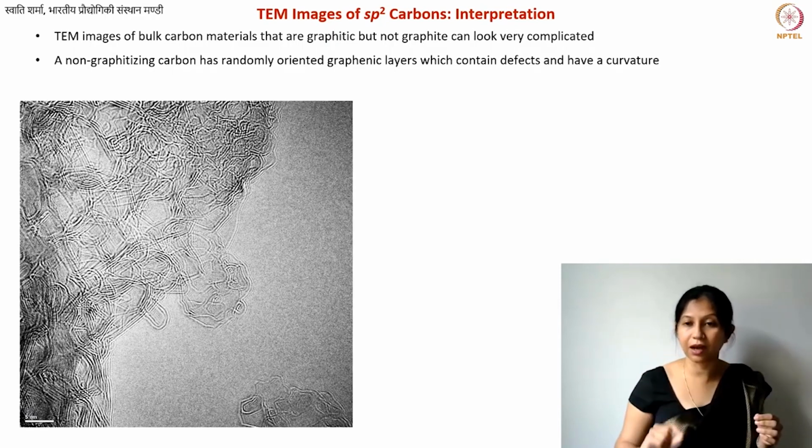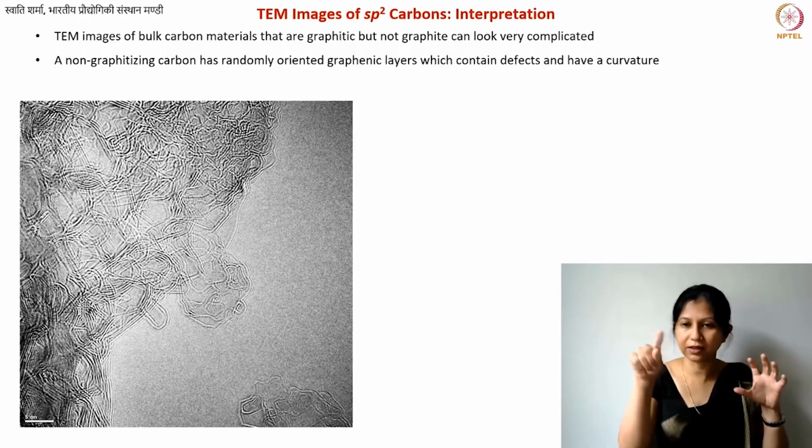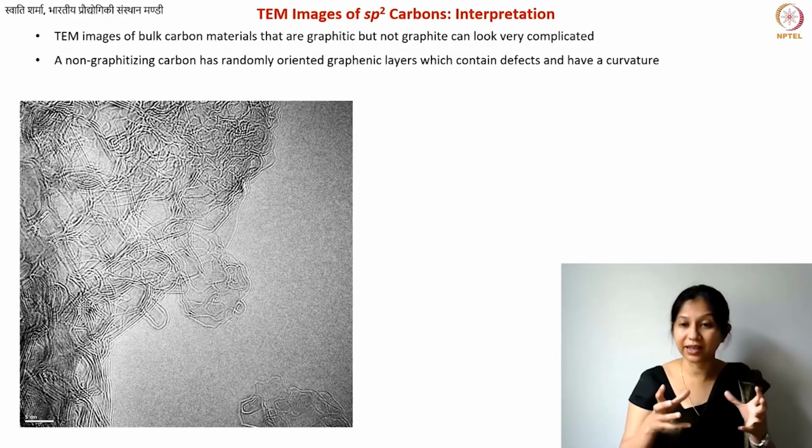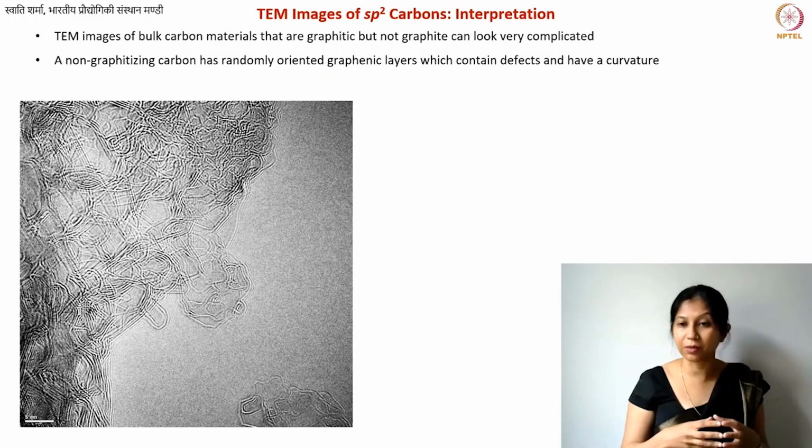When we were taking this particular image, what we did was something known as in situ TEM. In situ TEM means you heat your structure inside the TEM itself using a joule-heated substrate. You can purchase different types of substrates for transmission electron microscopy. Typically, what you use is known as a TEM grid. As the name suggests, it looks pretty much like a net, but it is made of metal, and it is circular, about a couple of millimeters in size. You place your sample on top of it, and then perform the imaging.